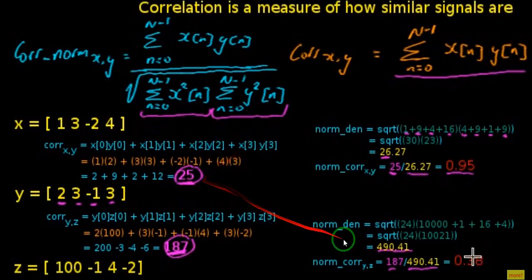And when the number reaches 0, you will see that the two signals are uncorrelated. This is really important. So remember that when this number is about 1, they are completely correlated, so exactly changing with respect to each other, and when it's 0, they are completely uncorrelated.